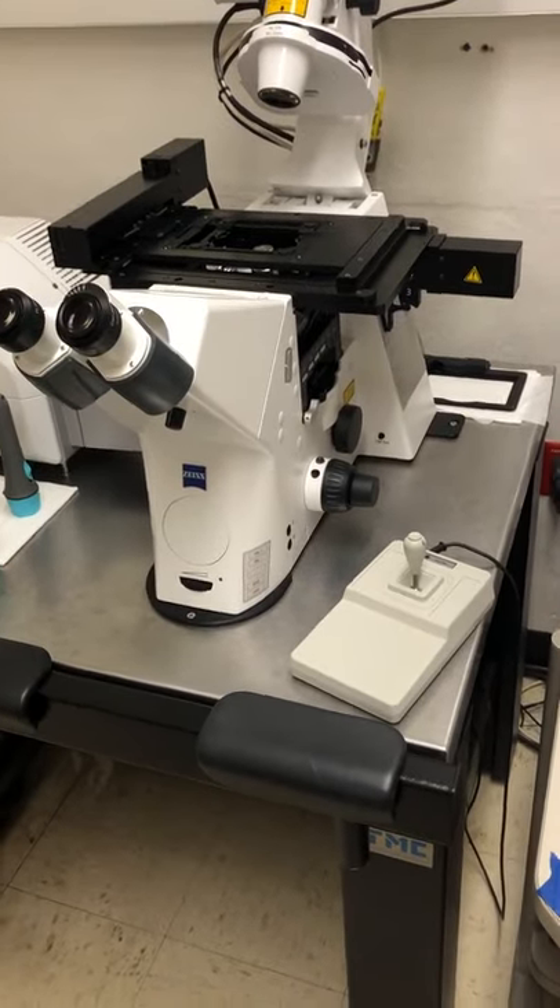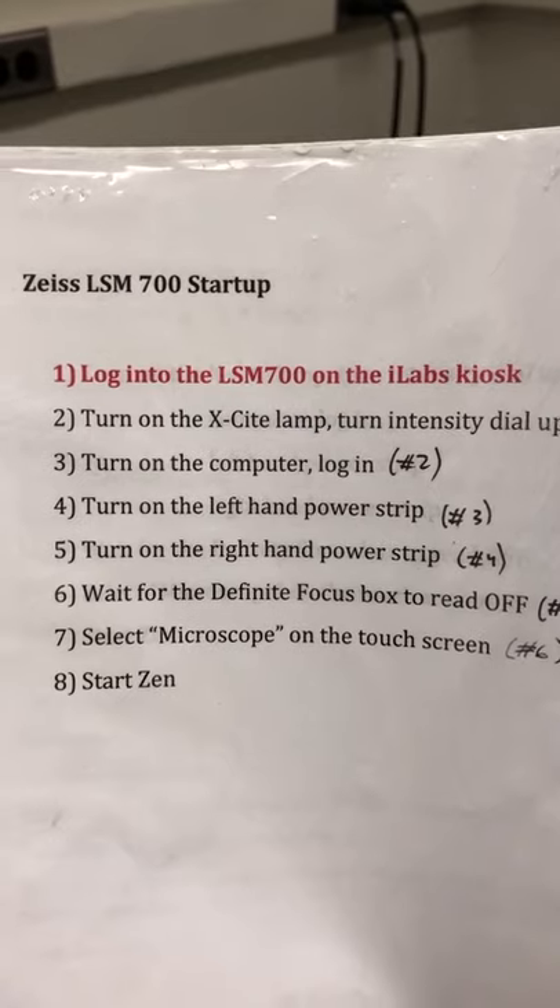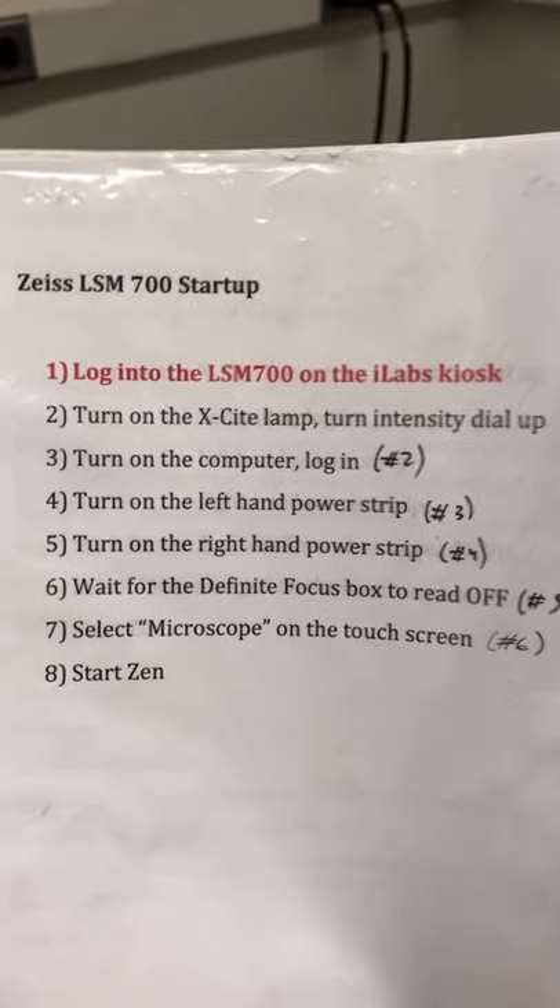The microscope is now disinfected, so let's go on with the normal startup procedure. The first step is to log into the LSM 700 on the iLabs kiosk — I've already done that.